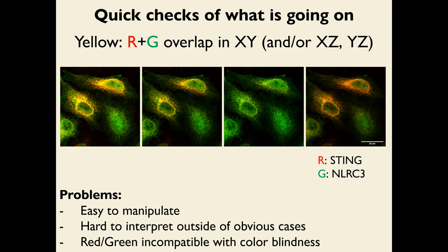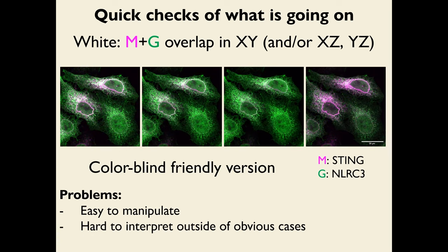The red-green display mode is also incompatible with colorblindness, which is fairly frequent. A colorblind-friendly alternative is to switch red to magenta, where overlap shows up in white — 'whiteness' instead of yellowness. But this has the same problems: easy to manipulate by contrast adjustment and hard to interpret outside of obvious cases.